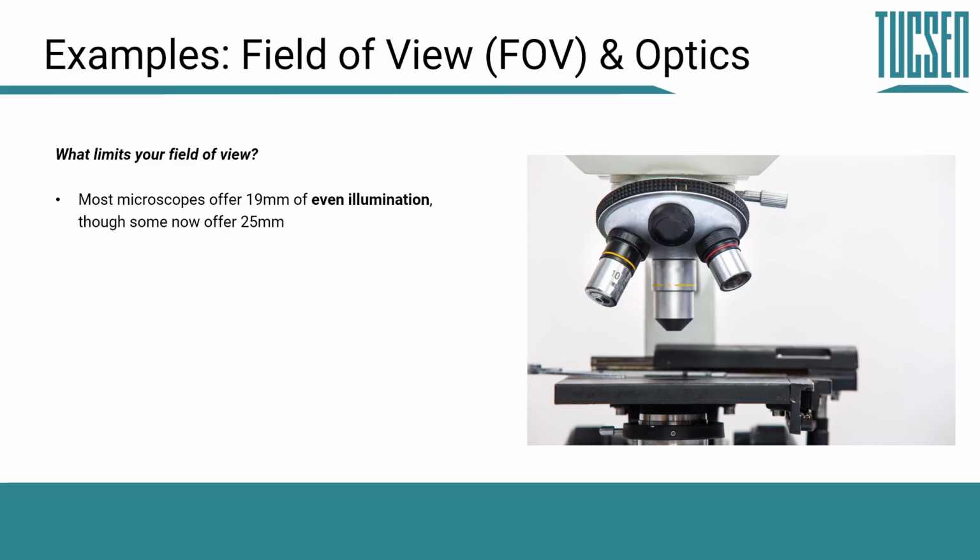Sometimes now, though, that's 25 millimeters for some microscopes, but usually there is some form of limit on the microscope side for how big the field of view can get. So it doesn't make a huge amount of sense for cameras to offer significantly more field of view than the microscope. But some custom optical bench setups can offer larger fields of view than standard off-the-shelf microscopes.